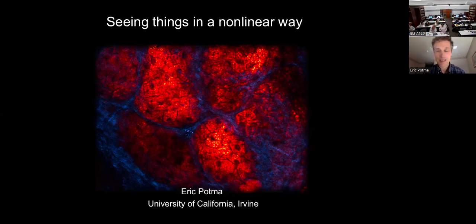And yeah, so today we're going to talk about microscopy in cells and tissues. It's laser scanning based microscopy, and I will emphasize nonlinear optical contrast mechanisms that you can use to learn a whole bunch about your sample. Okay, so let's dive in.